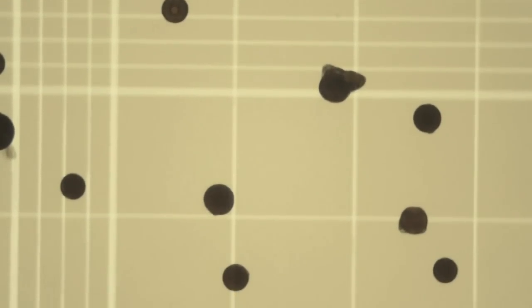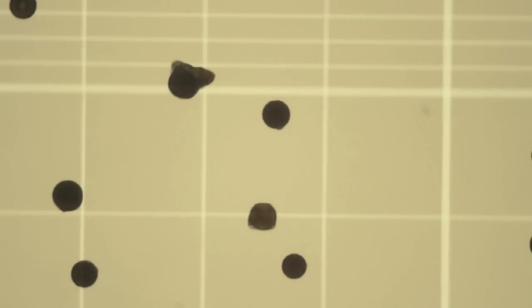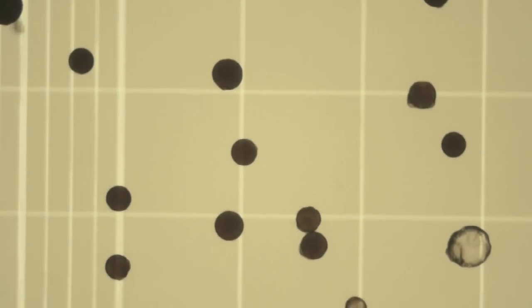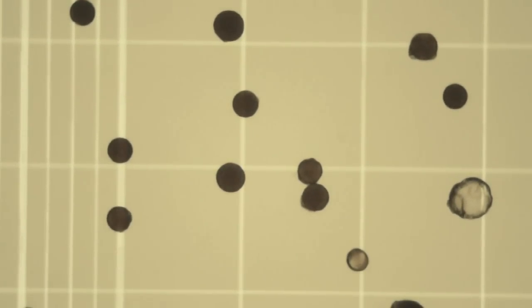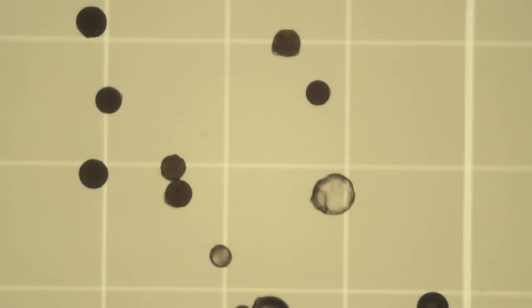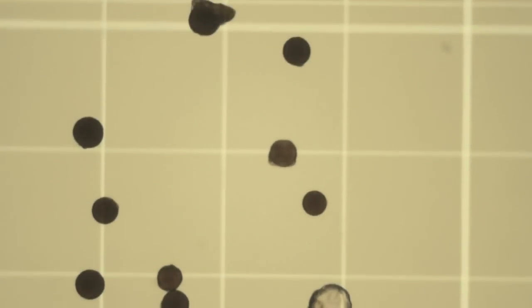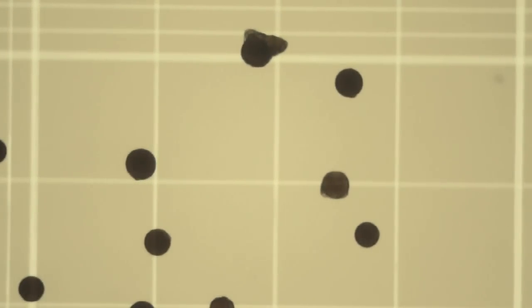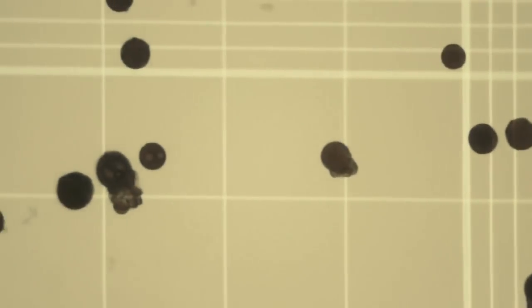Looking quickly at the lower left, there's 1 particle, 2, 3, 4, 5. That one's mostly out. 6. That one's mostly out. 7, 8. We have a couple of particles there that aren't dark. I'm going to score those as artifacts. So that gives us a total of 3, 4, 5, 6, 7, 8 particles. Okay, let's move now over to the next chamber.